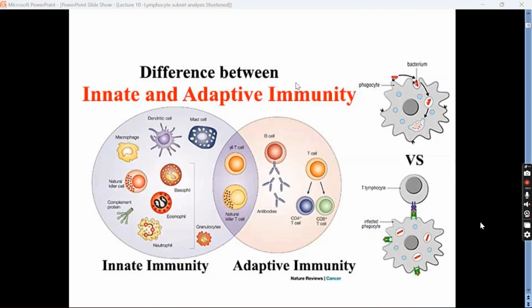In lymphocyte subset analysis, most people get the sample, and even if the technician is there, the company people will give you a software or a protocol. What I mean by a protocol is, we acquire the samples during acquisition, I told you, right? When you acquire the sample, you need to drag a protocol into which the data will be captured. That is called a protocol, or some people call this a template. So once you want to acquire a sample, you need to acquire it on a protocol or a template.